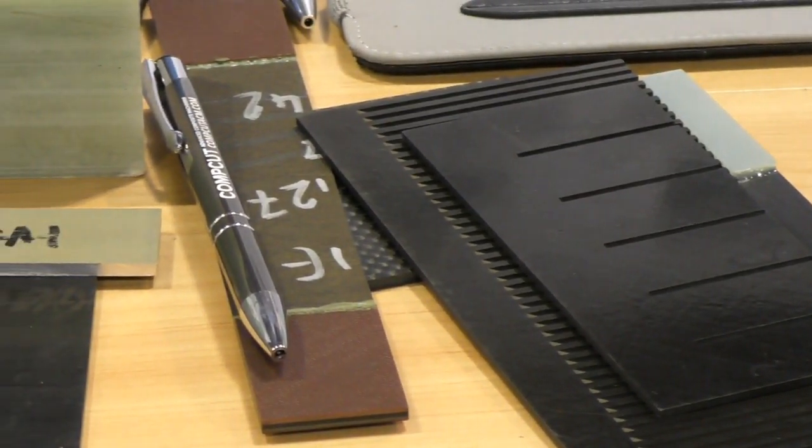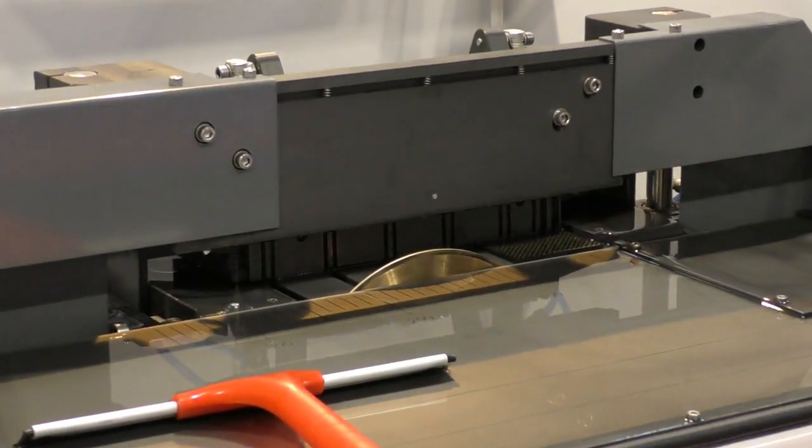One of the key selling points of our machines for anybody cutting composite test samples is that they have to be cut with a very clean finish. They also have to have very good parallelism — both sides have to line up wherever you measure, whether here or here — as well as perpendicularity for the corners, so you get a perfect corner. With our machines you're looking at about 0.02 mm over about a 100 mm cut, which is very precise and within international standards. So you can actually test straight from the machine without needing to deburr and polish, which is why people have been bringing their samples in to cut today.